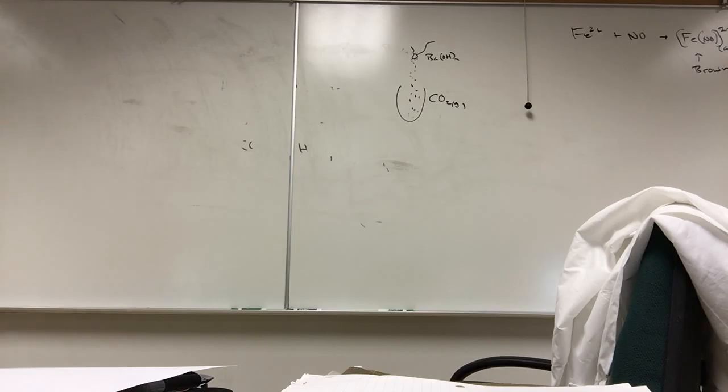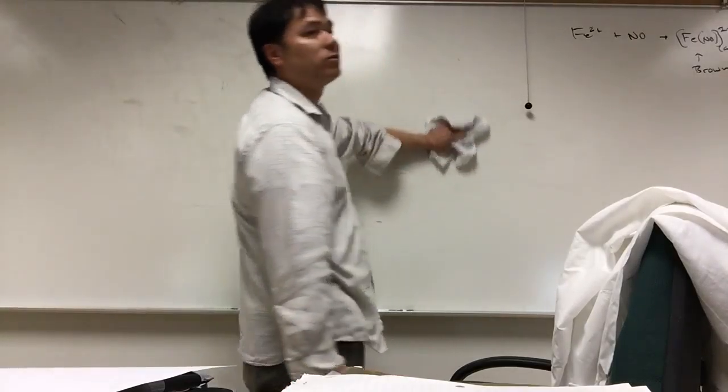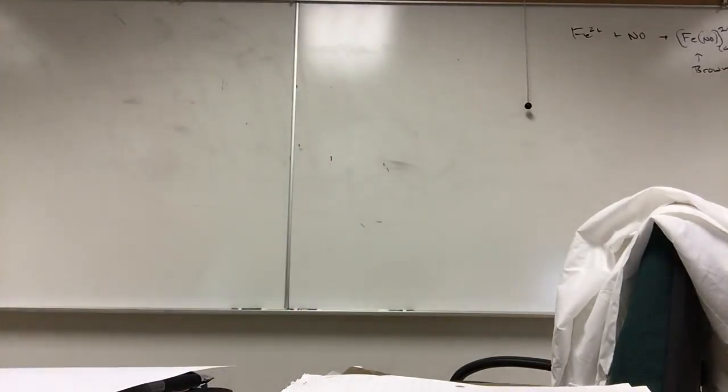All right. If there are no questions, let me briefly go over the anion analysis and write down the observations and equations for the anions. What's the first anion you're testing for? Sulfate? You've done the sulfate test before in Chem 1A, and so this test is going to be very similar.